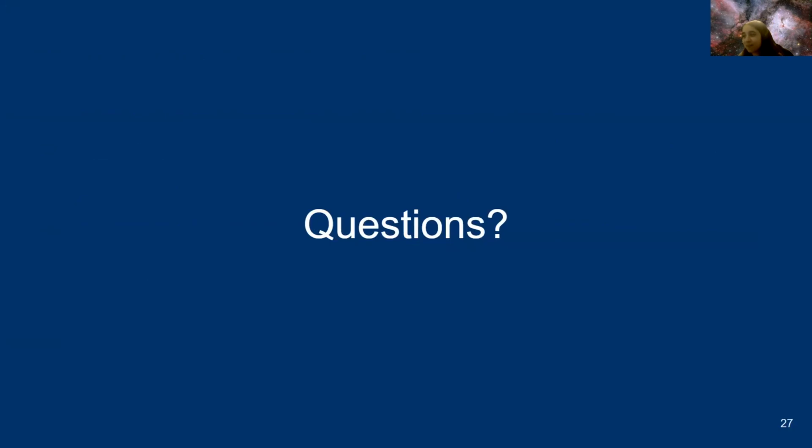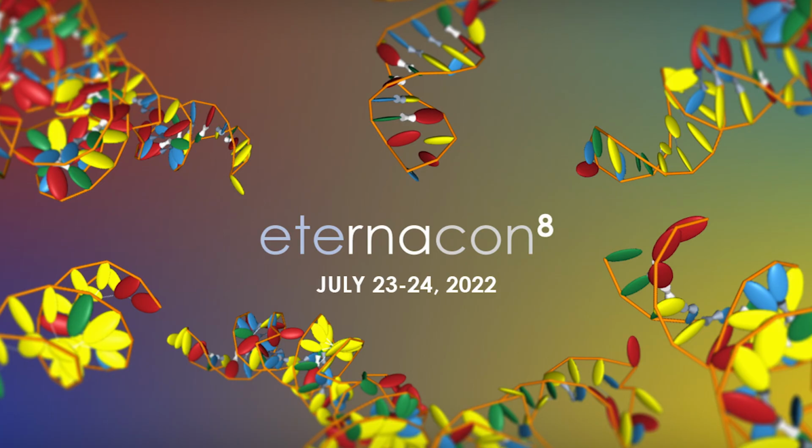And with that, I'll leave it open to questions. Also, during this question and answer session, if you want to see anything directly within Chimera, I have that window open if you want to test anything live. Thank you, Slava. Right, yes, I'm just now catching up with the chat. So, Ome, you had a couple of suggestions?